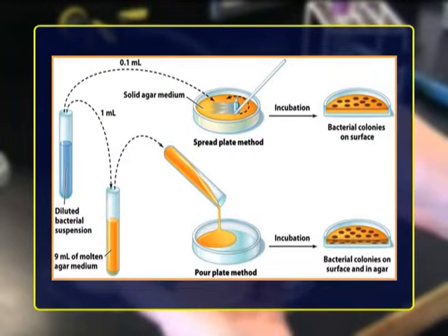When the colonies develop on the agar medium plates, it's found that there are some plates in which well-isolated colonies grow. This happens as a result of separation of individual microorganisms by spreading the drop of diluted liquid on the medium of the plate. The isolated colonies are picked up and transferred onto fresh medium to ensure purity. In contrast to the pour plate method, only surface colonies develop in this method and the microorganisms are not required to withstand the temperatures of the melted agar medium.